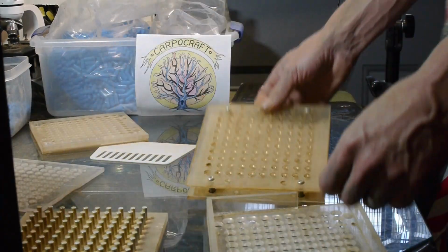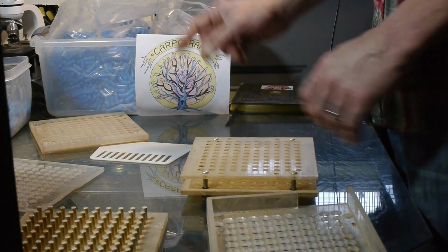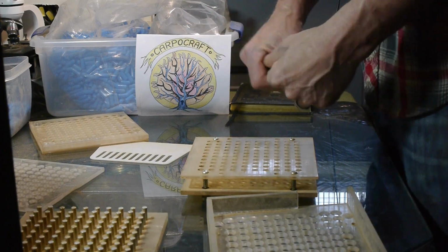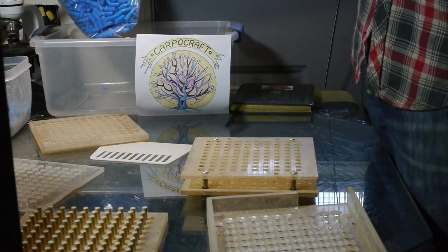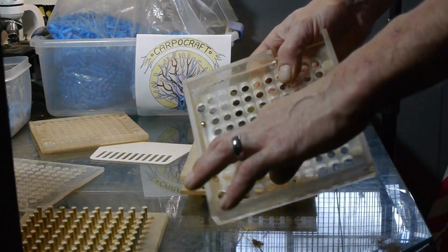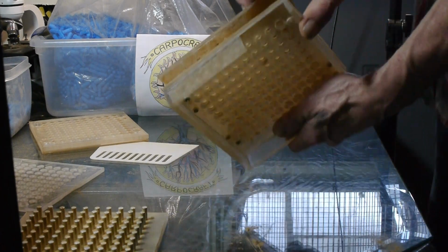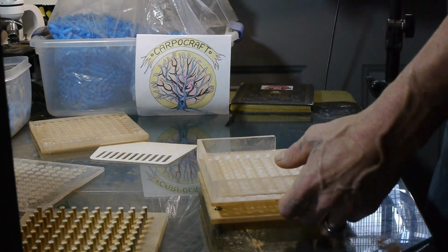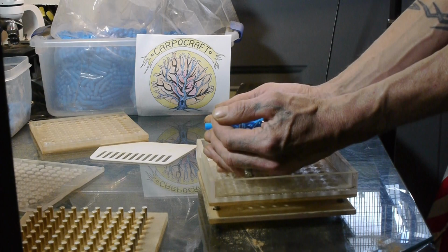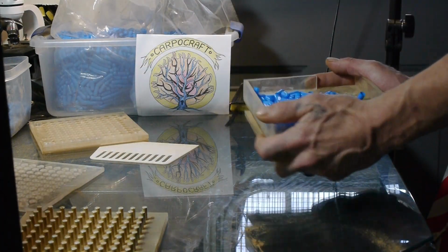So, first thing you do is you take this part, which has this little spring action thing. This is for the one half of the capsule. You can buy capsules either single, where they're all put together, or you buy them in halves. I paid a little extra to get them in halves, and capsules aren't cheap either. It has walls on it to hold the powder, but it's also for holding the capsules. You see it has one side missing, so you can just dump stuff back out of it. We'll get to that. First thing I do is I take a handful of these. Booyah. Just like that. A whole handful of capsules.